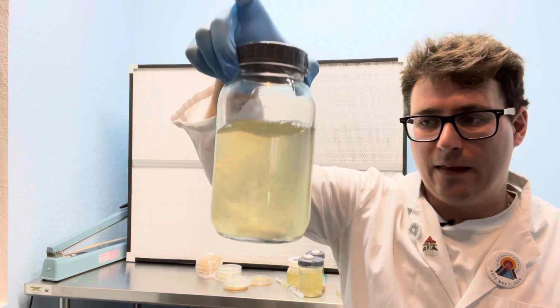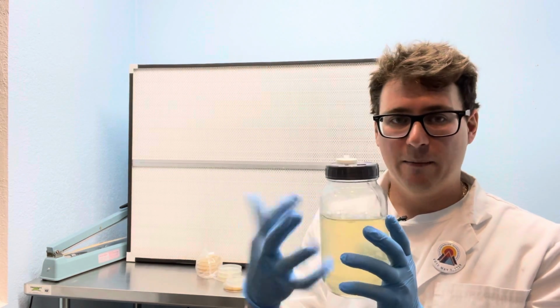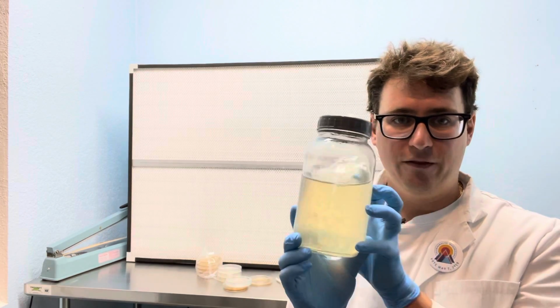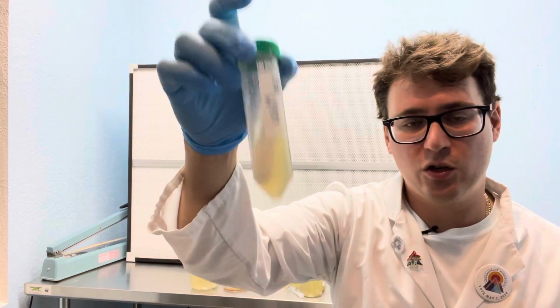The longevity of a liquid culture could be years and years, but eventually the mycelium is going to utilize all of these nutrients before it would with a slant, which is why these are usually used for a long-term storage solution.